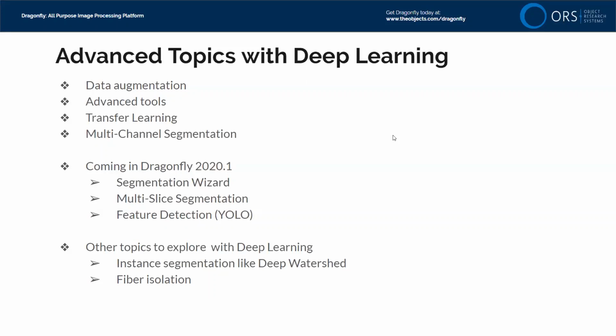Next question is, if I want to train a model to segment 2 different data sets, should I add both data sets and provide training ROIs from both? Short answer, yes. The long answer is there's a lot about deep learning, and a lot of the parameter space that hasn't been fully explored. So I wouldn't be surprised if someone comes along and finds data to prove cases where I'm wrong. But the short answer is yes.